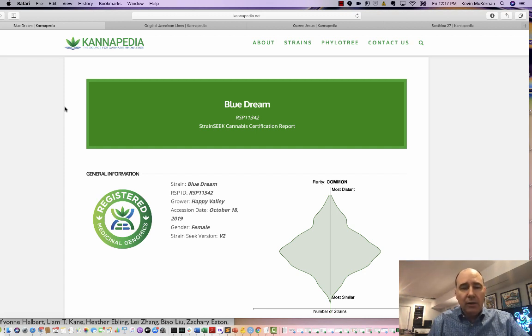But we've also tiled some key genes. Over 926 genes have variants in them that you can track as tag SNPs, but we also target CBD synthase, THC synthase, and cannabichromine synthase very heavily so you can get full gene coverage over those genes. This means you can look for mutations in those genes, or if those genes are deleted with this tool.